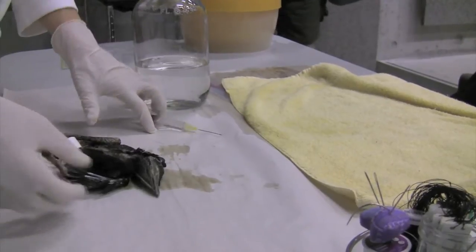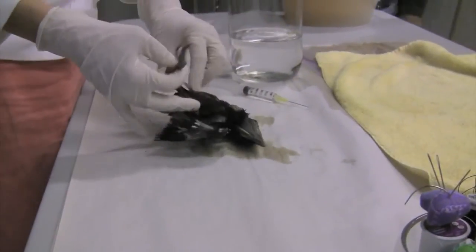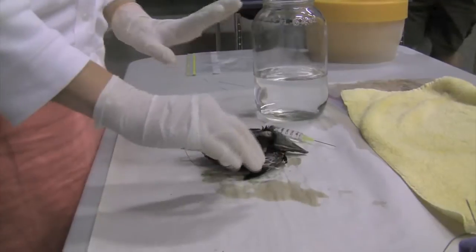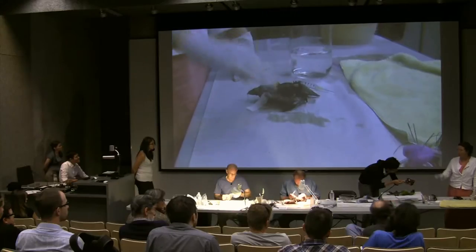Once you've done all that, once you've got all your data and you've added a tag, unlike with skins, you're going to use special fluid tags for fluid specimens rather than the usual paper tags.